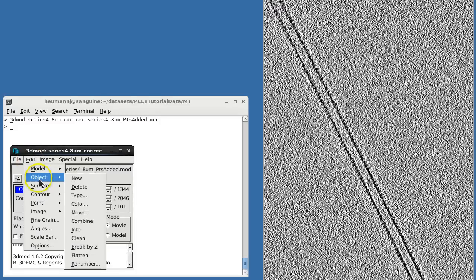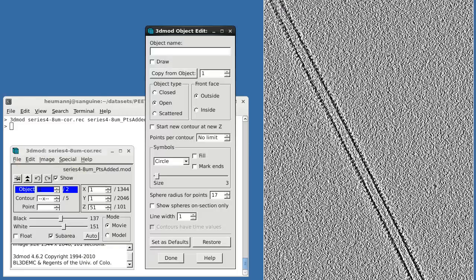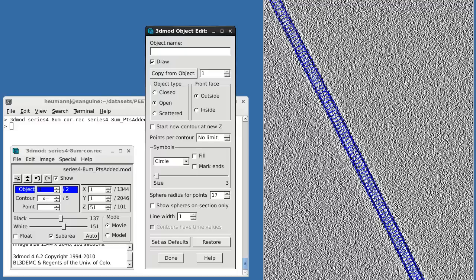As a result, we've placed model points, shown in blue, every 8 nanometers along the center of the microtubule. Adding this many model points by hand would be both tedious and inaccurate, so PEET provides a program called addModPts to assist with this process.